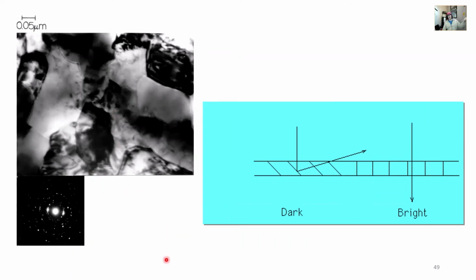So if you remember back to X-ray diffraction, we showed that if your material, if your specimen isn't oriented to the proper diffraction condition, you're not going to see peaks. Well, here, this is kind of the same thing. So we have different grains that are oriented in a drastically different way, and that's causing the beam to deflect somewhere else. Okay, so we have these lighter grains and they're oriented just so the beam can pass through them. And it's different than thickness contrast, and we'll get to that in a little bit.